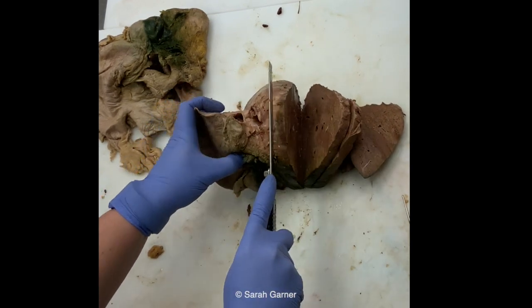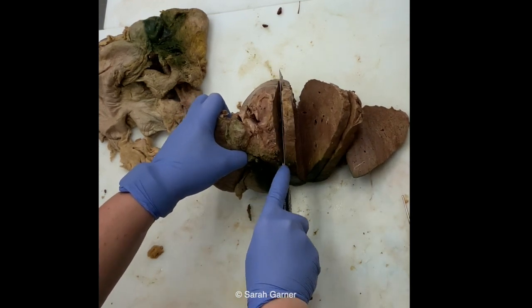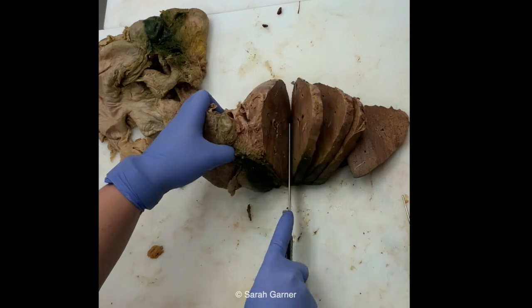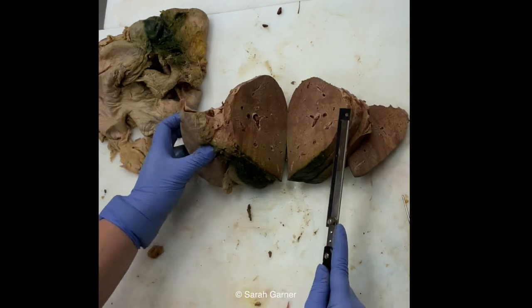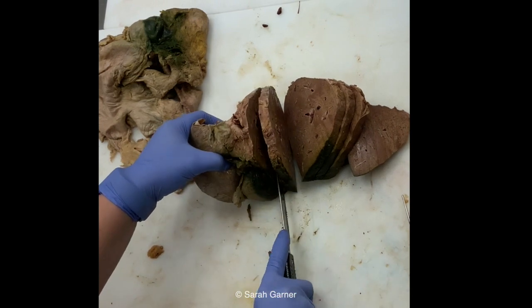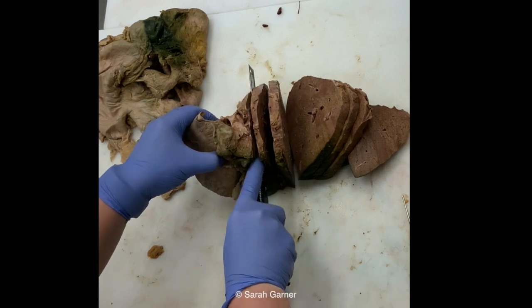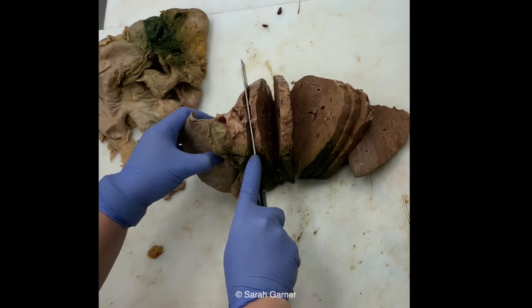And you want to make sure that you're cutting it thin enough. Like, I probably cut those a little bit too thick. Thin enough that you're getting a good representation of the cut surface, but you also don't need to feel like you need to cut it at 0.2 cm. So happy medium. I'd say 0.4, 0.5 would be ideal.